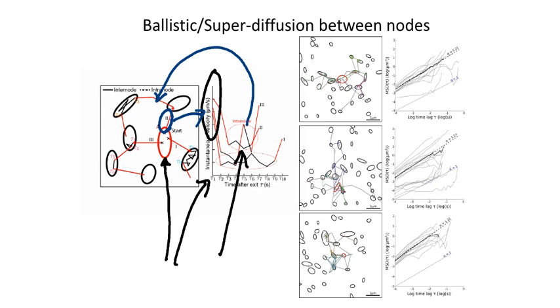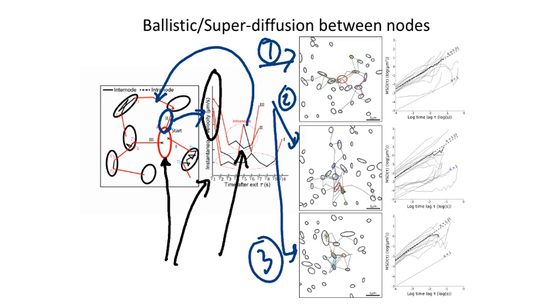And so those are three examples, 1, 2, and 3, where you can see that, conditioned on a trajectory starting specifically here at the red, where the red ellipse is marked, we could follow how trajectories are actually going into these different directions.